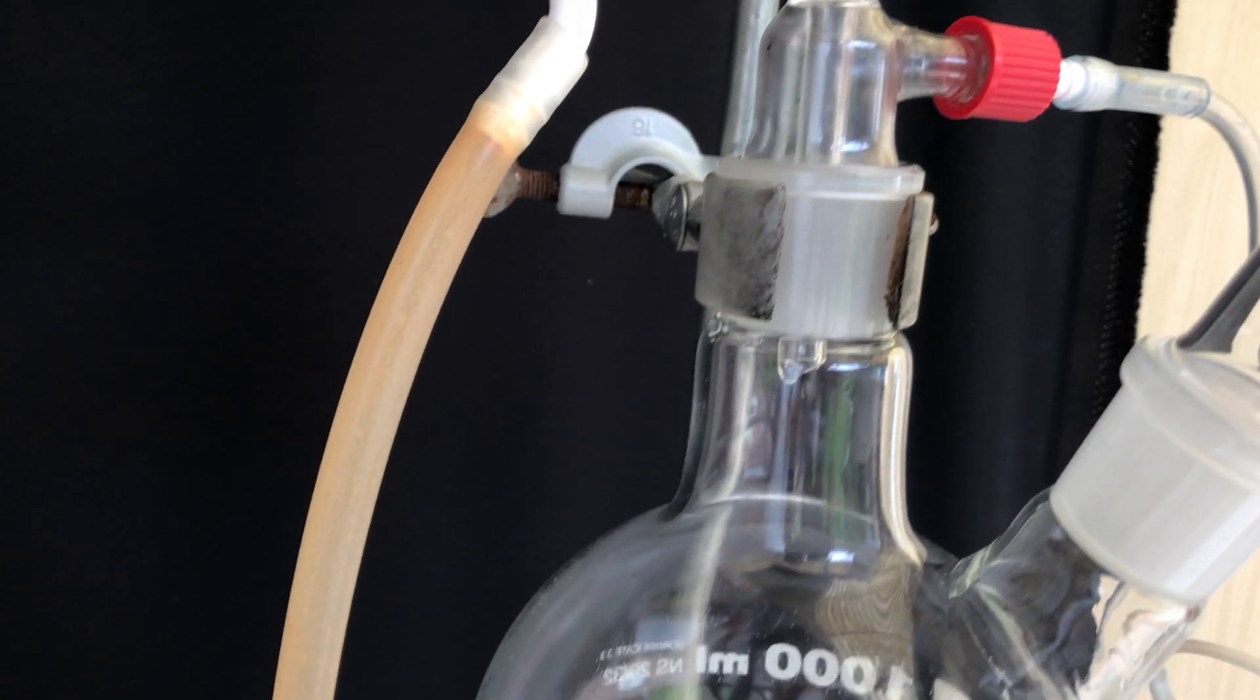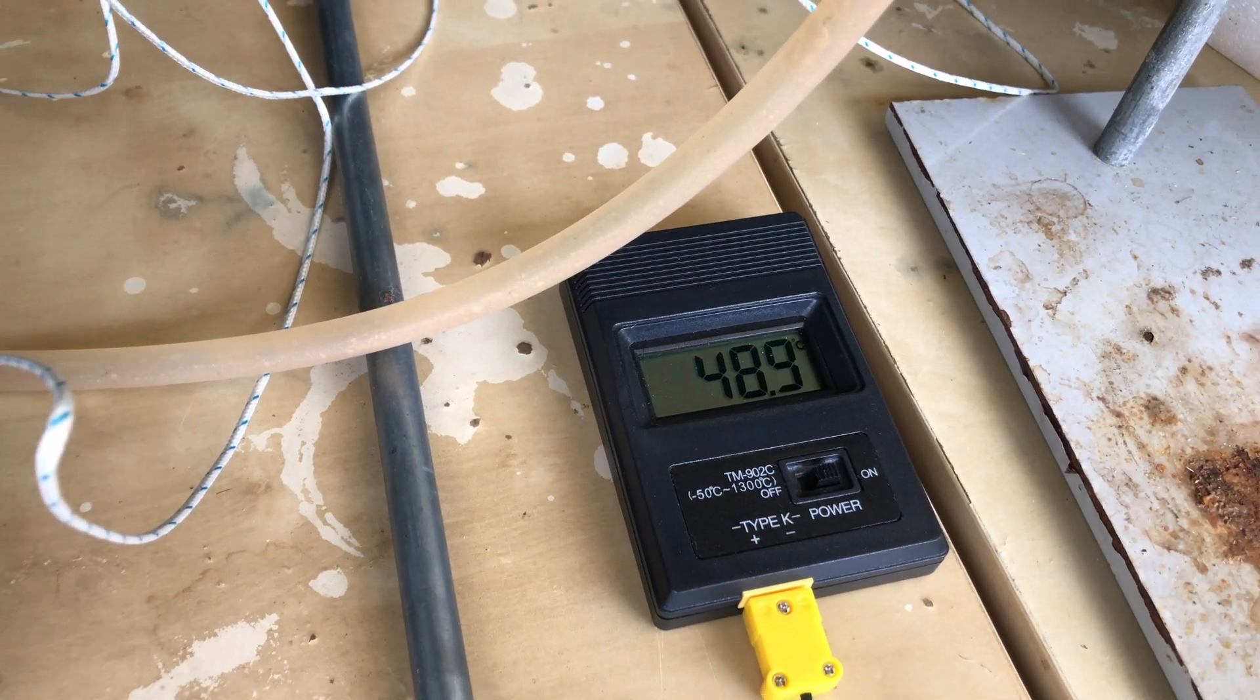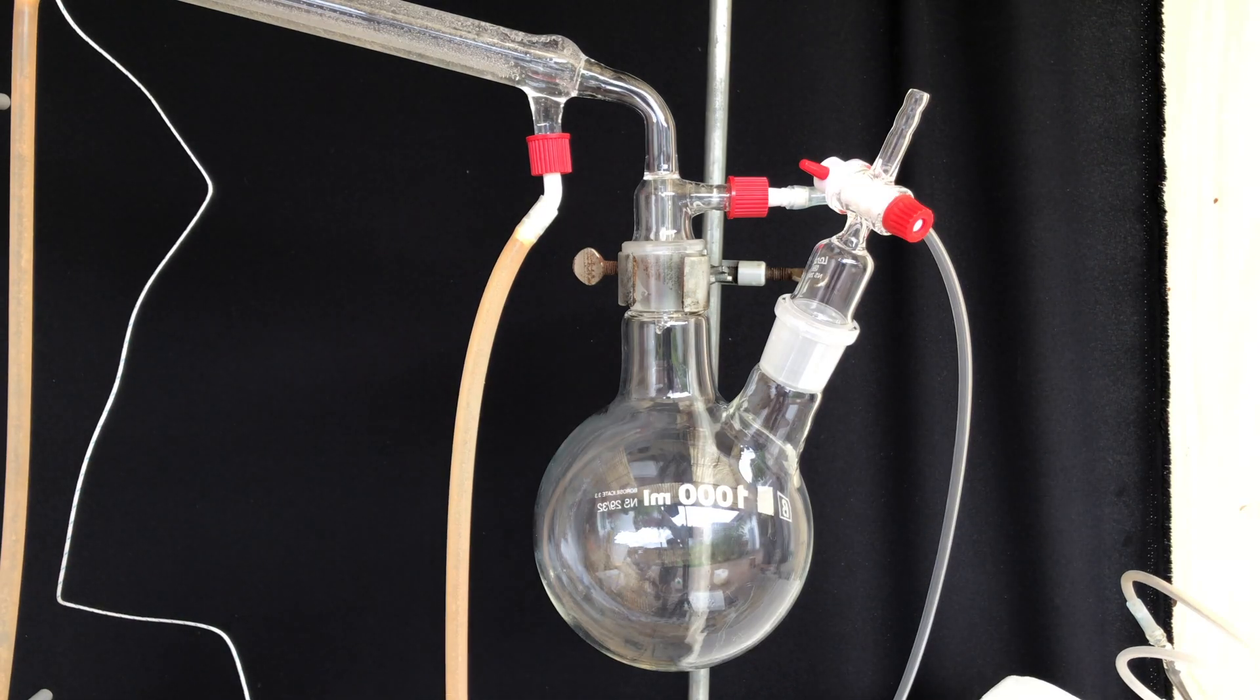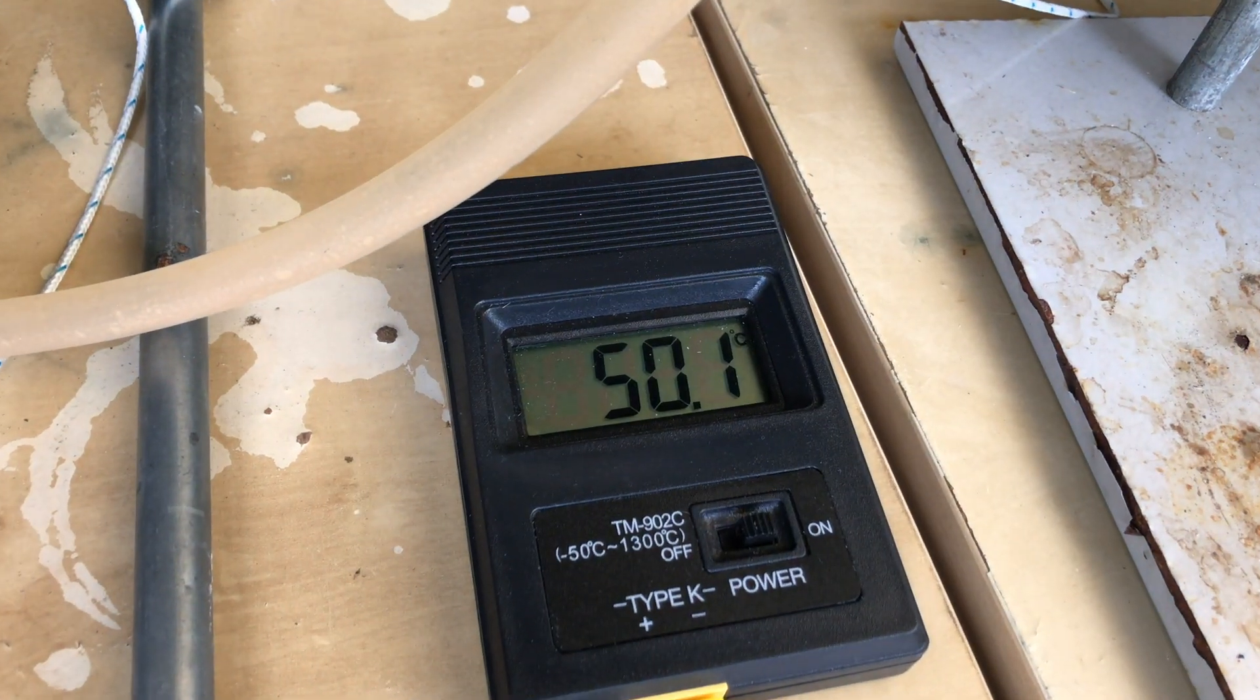Heating and stirring were turned on and after a few seconds the first drops of liquid came over. When the temperature at the top reached 84 degrees celsius I swapped out the collection flasks.